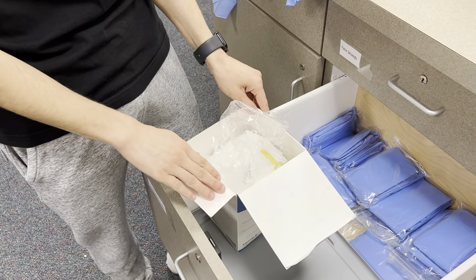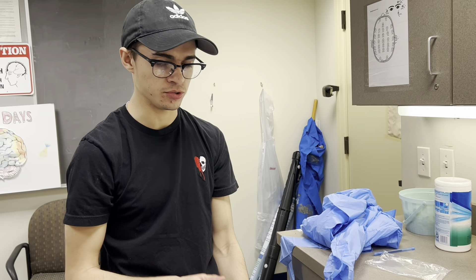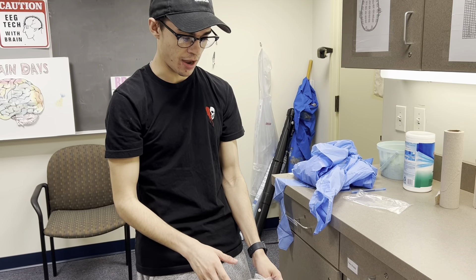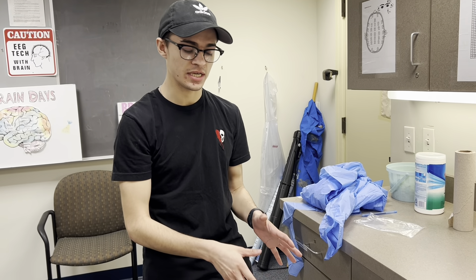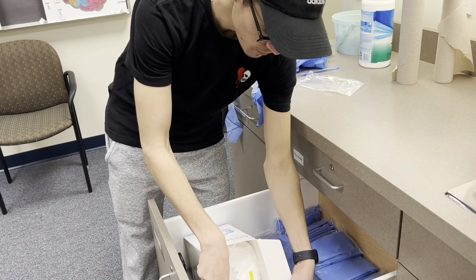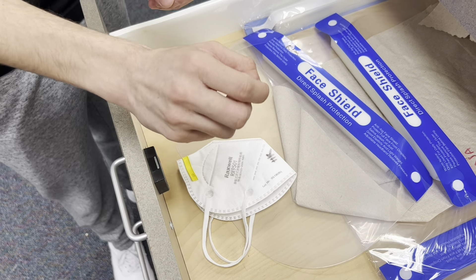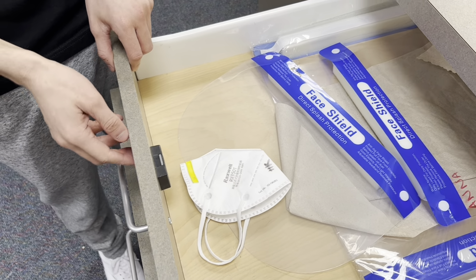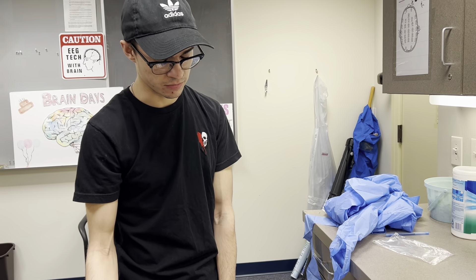Masks are a very big part of the lab. These are KN95s. You can take masks from the lab, but you should use only one. We use these particularly for giving to research participants who come in without a mask, given COVID and any other sickness. So if you really need a mask, you can take one, but what you can do is put your initials or full name on a mask and put it up in this drawer. Try to consistently use the same one and reduce in-lab mask use to just the research participants until you get your own supply.